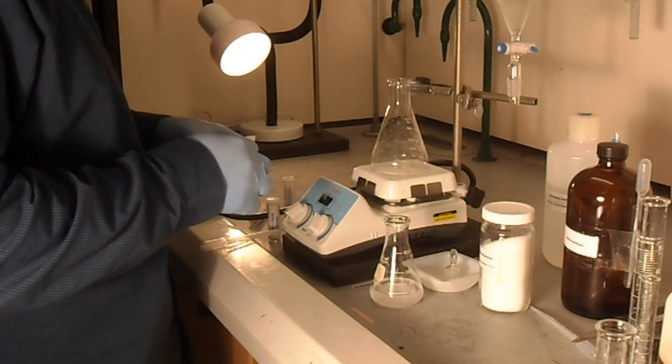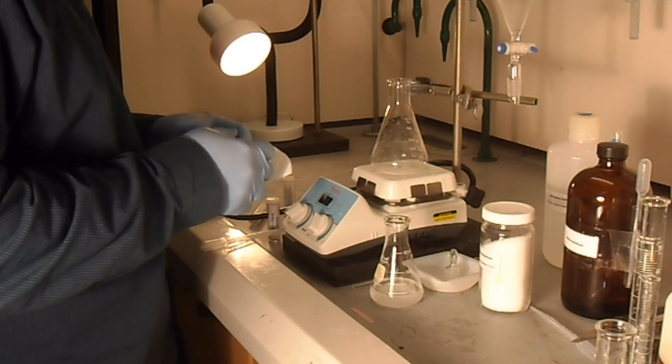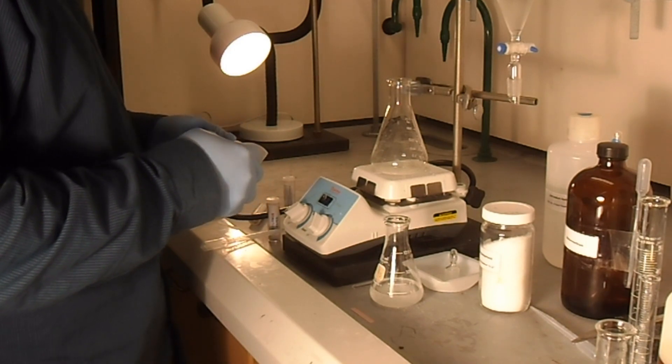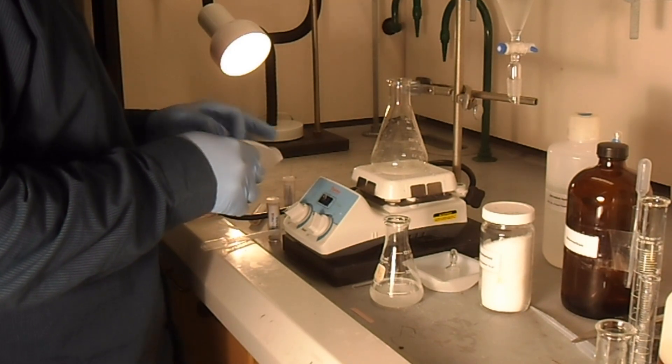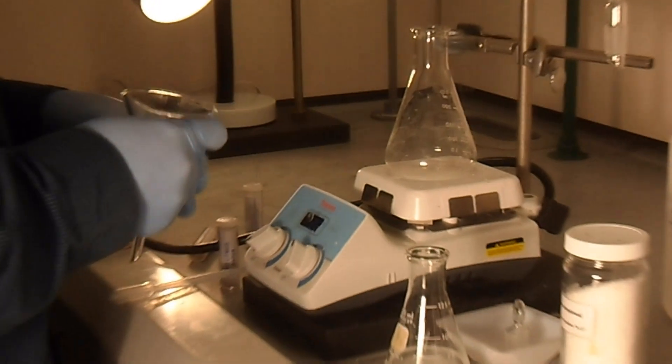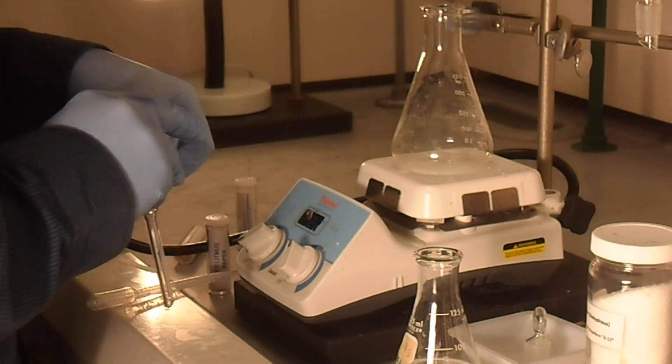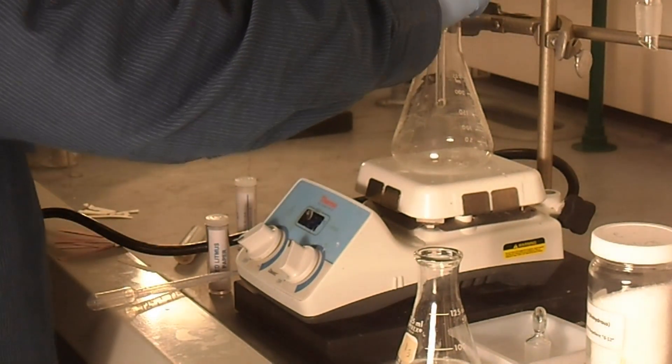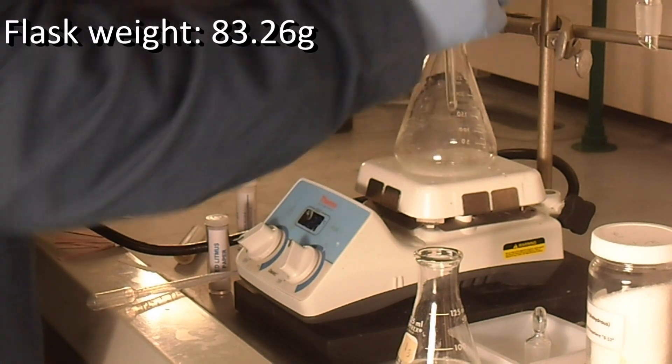So, now that we have our solution dried, we're going to do a gravity filtration to remove the drying agent. We want to make sure that the Erlenmeyer flask that you're going to be filtering into has a weight, and the weight of that flask is 83.26 grams.